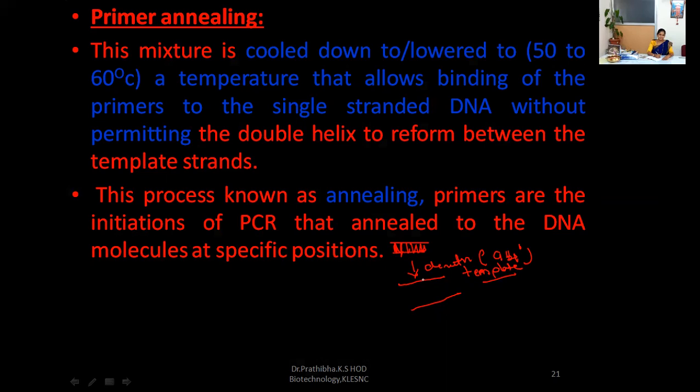Once we get these two template DNA strands, next in this instrument we are going to lower the temperature to 50 to 60 degrees Celsius.